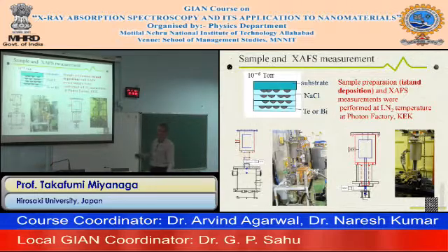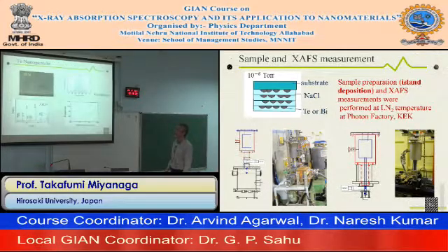Why do we use liquid nitrogen? These samples, tellurium and bismuth, are very unstable as nanoparticles. So at room temperature, they easily change to the crystalline state.